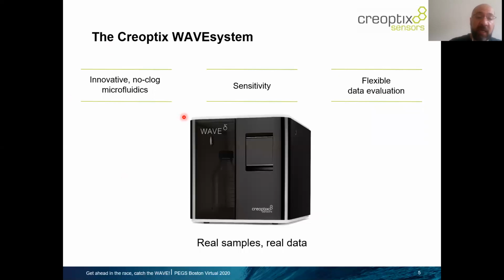This is what I will highlight today in my talk. First, a no-clog microfluidics, a new design that allows you to resolve very fast kinetics, and because there is no clog, the possibility to use any type of sample, including very crude samples.